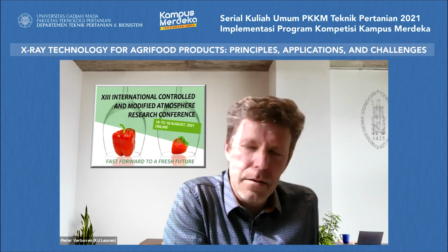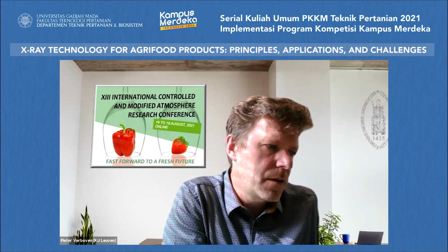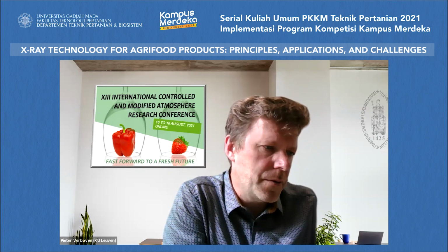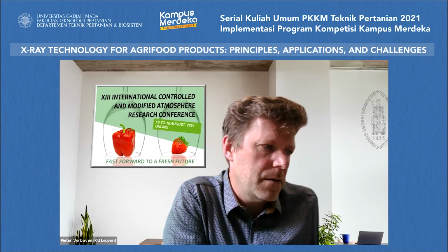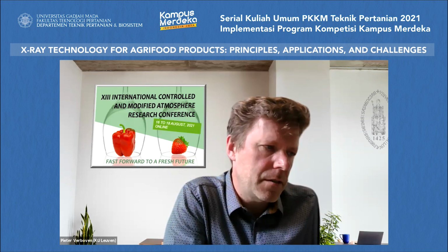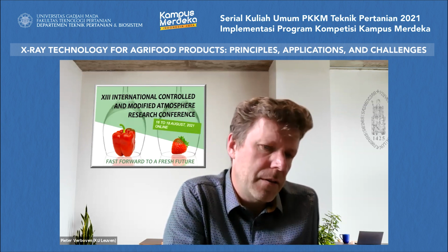And then with respect to the interaction between plants and soils, this is also a very active area of X-ray research where they use soil columns where plants are being grown, and then at regular intervals these samples are put into the X-ray to see how the plant is developing and how the root system is developing, how it is interacting with the soil, and how the plant eventually emerges.